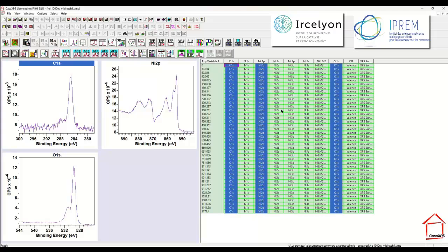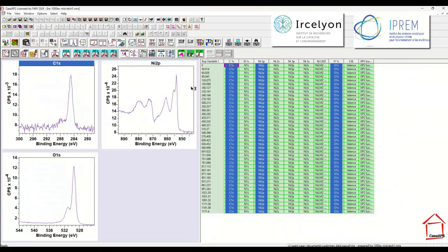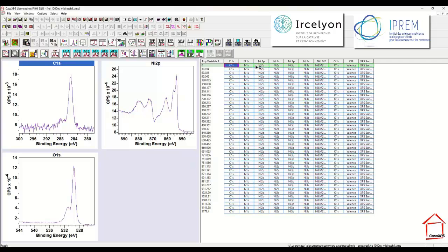So here I'm able to select the VAMAS blocks that I'm going to work on, and this will be true of all of the files, as you can see. So we'll go back to the full page view. I wish to create the regions using this Add Regions button. So I just clicked the button, I made a selection, and I have now a set of regions defined.